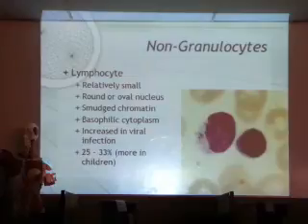Lymphocytes can vary from a small, mature lymphocyte like this one here on the right side, about maybe 10, 12 microns diameter, to the one on the left side, which is also a normal lymphocyte, about 20, 25 microns diameter. So it varies.